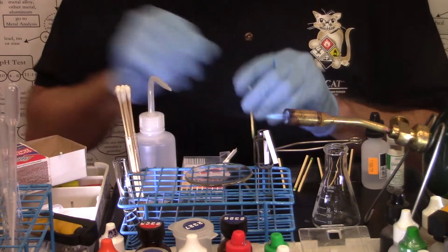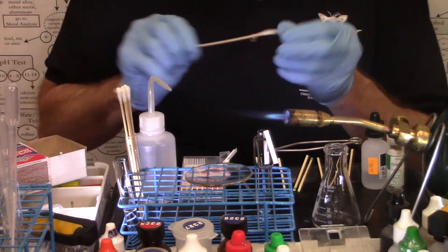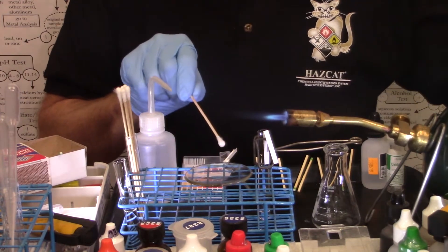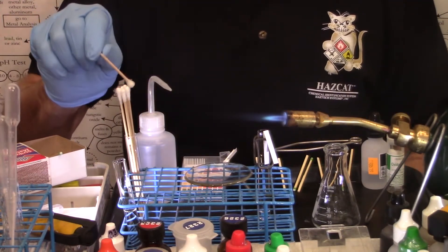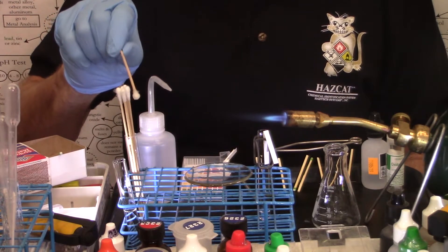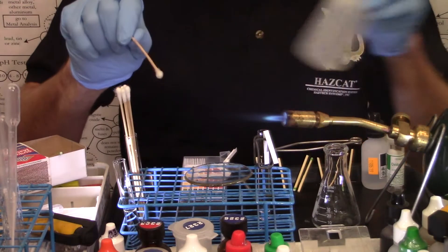We'll start out by taking a cotton swab, rolling it in the unknown liquid and then four inches away from the tip of the inner blue cone, I'm going to put the swab into the heat and roll it back and forth, gently.